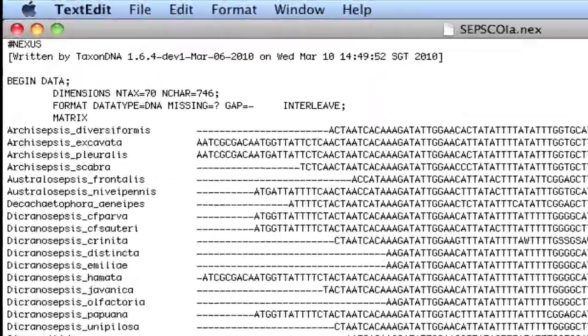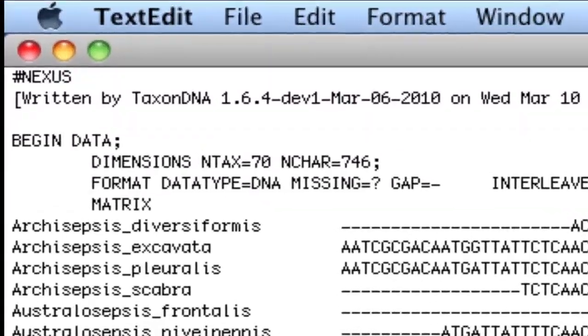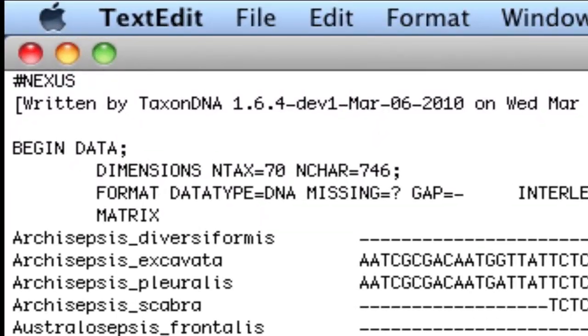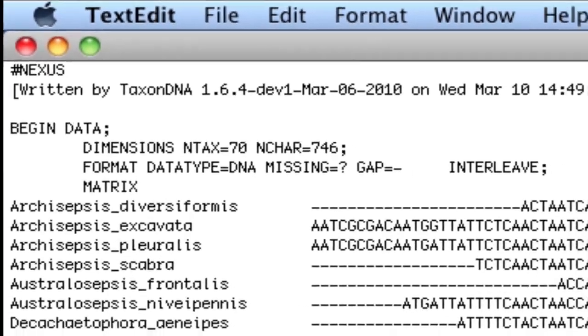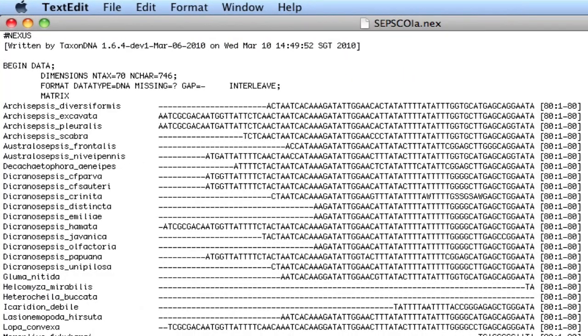This Nexus file adopts the fairly standard practice of using question marks for missing data and dashes for real gaps. However, our alignment program has coded missing data at the beginning and end of each sequence as dashes, but these should be question marks.